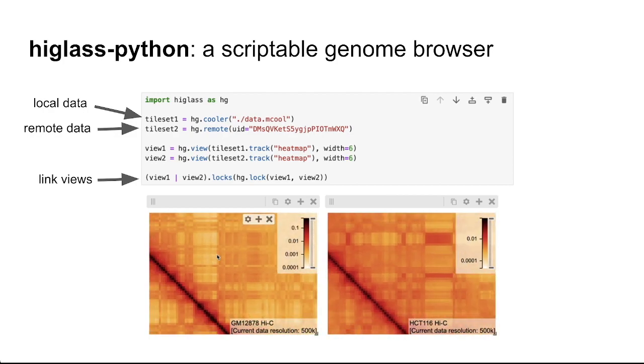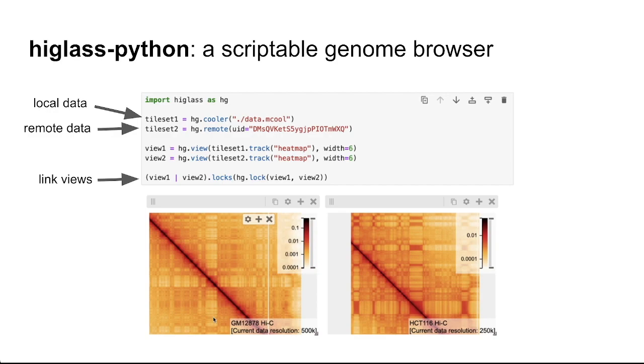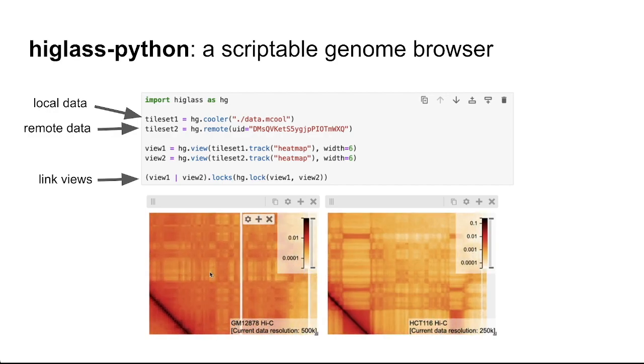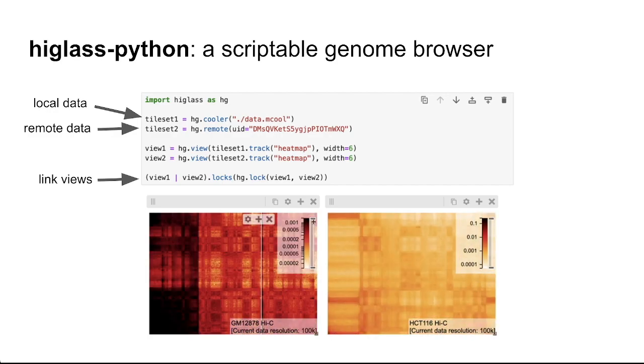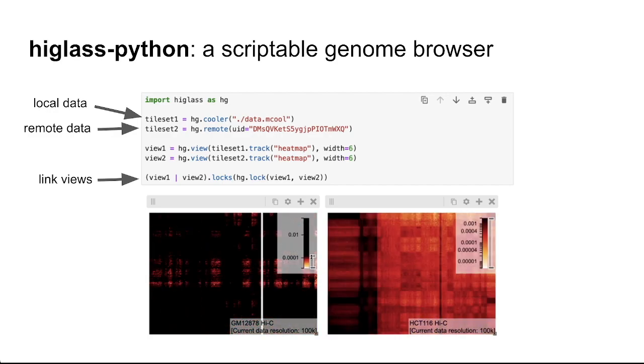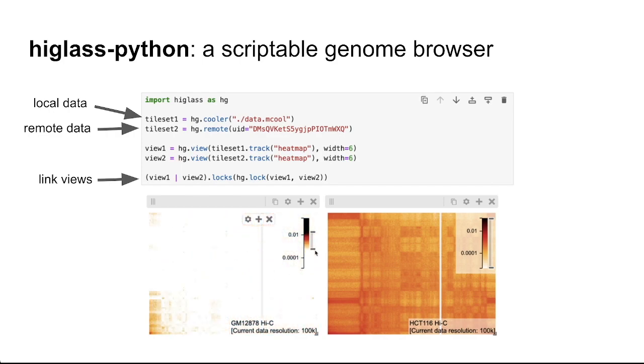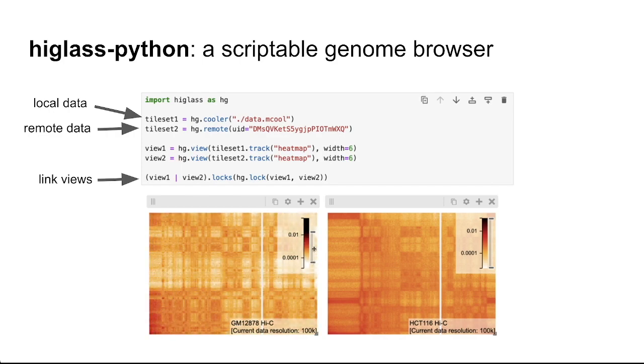And then later, views that are constructed from these tilesets can be linked in a single line allowing for simple pan and zoom interactions of datasets that are federated and live in separate places.